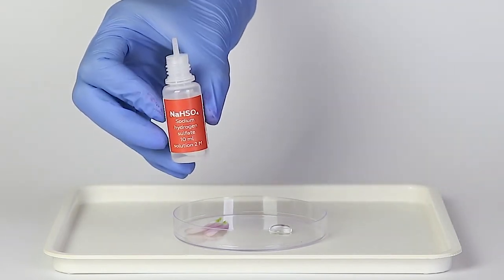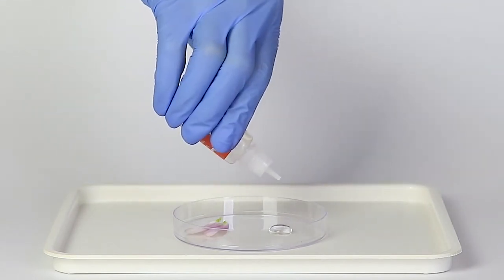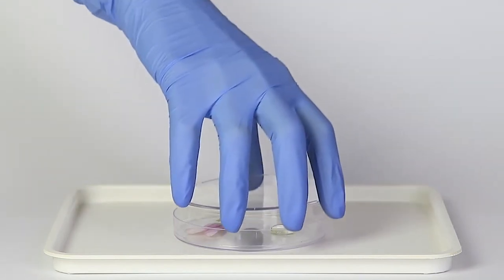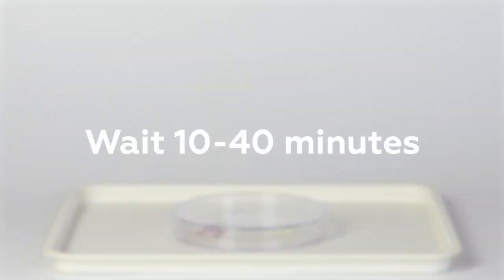Then add 5 drops of sodium hydrogen sulfate to the drops of sodium pyrosulfite. Cover the petri dish and wait for 10 to 40 minutes.